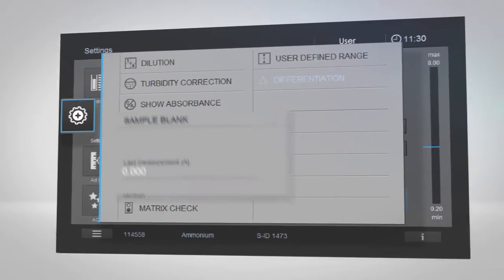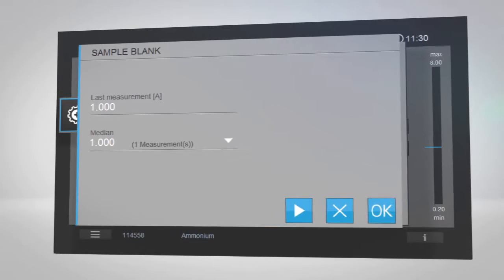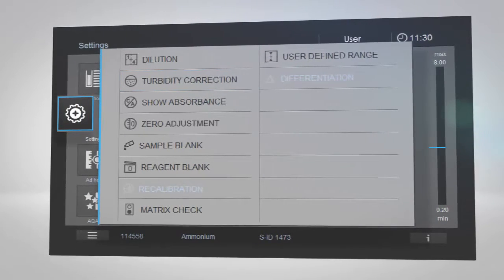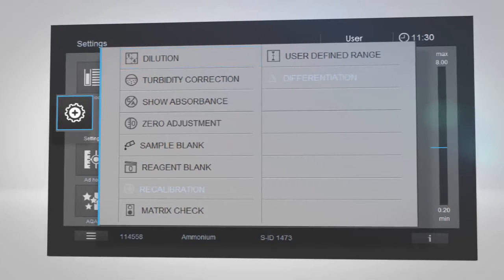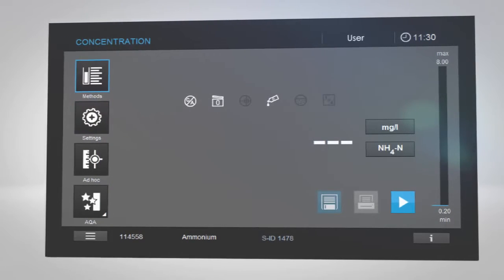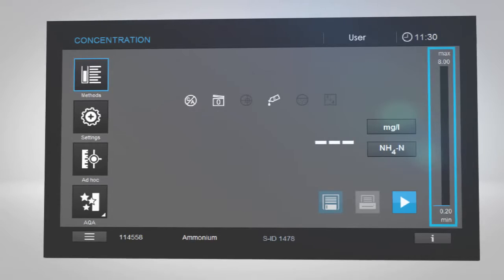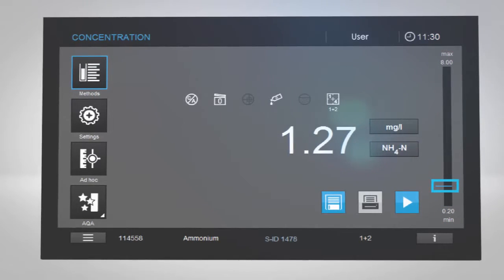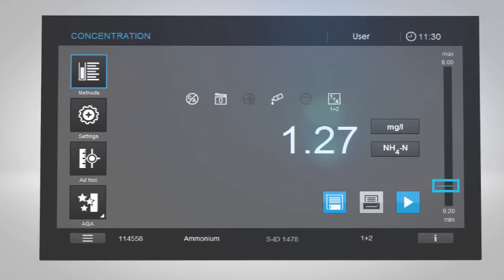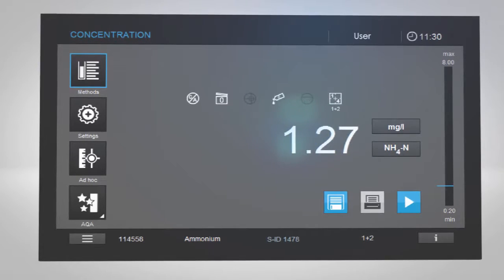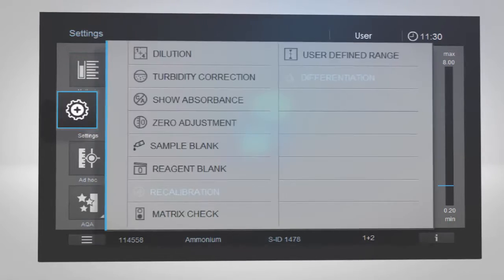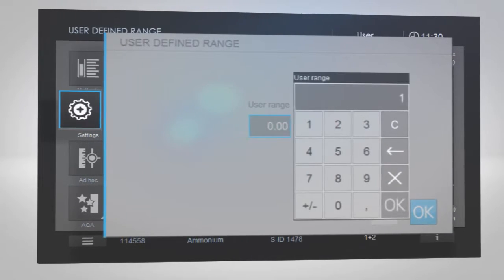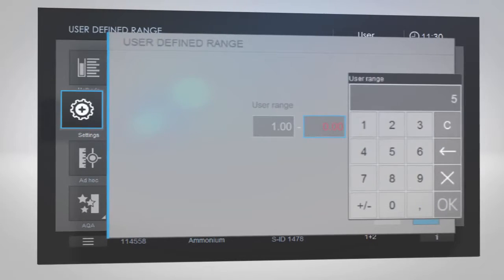For example, you can enter sample or reagent blanks, add turbidity corrections for turbid samples, or assign a dilution factor. The vertical bar on the right of the screen shows the measuring range for the method you selected. The blue line indicates where your result lies within the range. To specify a smaller measuring range, tap the settings icon, then tap user-defined range. Enter minimum and maximum values, then tap OK.